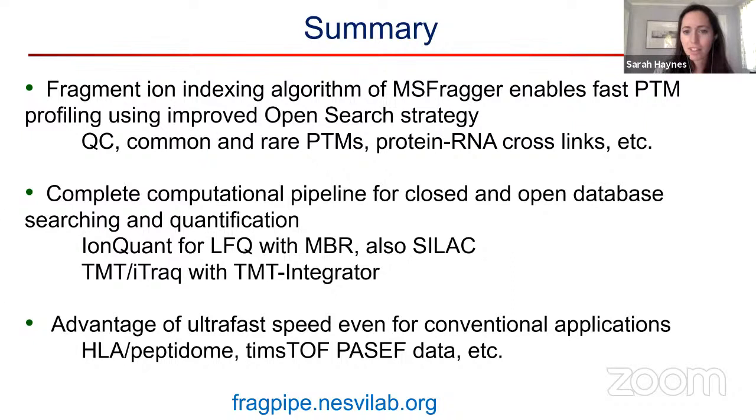I just wanted to mention that a lot of the questions are about specific technical questions about compatibility with different instruments and different workflows. We do have that information on the FragPipe homepage, and I can post that link in the chat in a minute, or maybe I don't have the ability to do that, so it is probably best to post this in the Google Doc associated with the session. I think we have a link in there, but if not, I'll definitely add one.